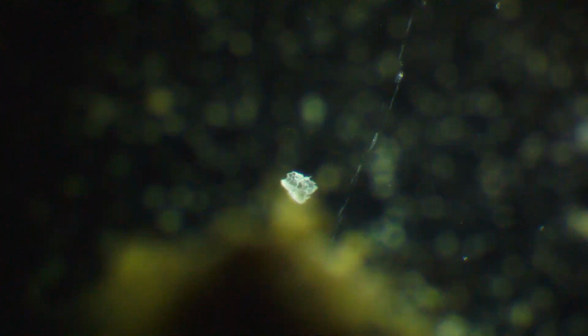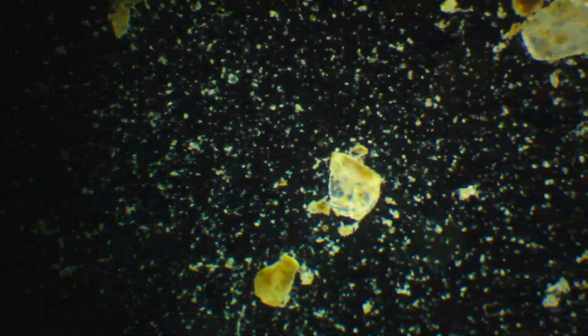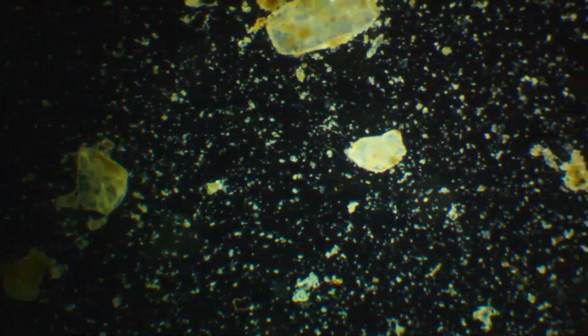What is this, a bubble? Oh, I think we got a scratch on the bottom of the slide. See if I go all the way down. Oof, a little pockmark on the bottom of that slide. Just going through here, see what else we might be able to see. This is actually the first time I've seen anything from this sample.